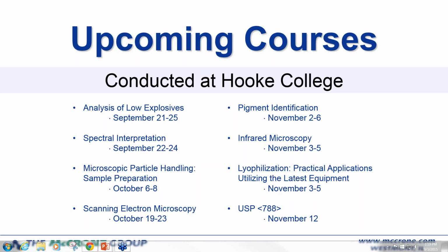You can think about the environment that the sample was removed from and what other types of materials the sample might have been in contact with. You can also try maybe doing some solvent extractions of the particle to see if you can isolate that unidentified component and get an infrared spectrum of that material as well, and that may help you to identify it.